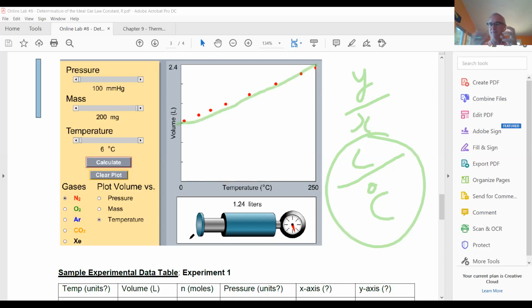So we're going to have to do some calculations, some permutations, move some things around. How will we know that when we've plotted the line, that slope equals R? What's going to tell us that, yeah, that's R, that's what we're looking for?